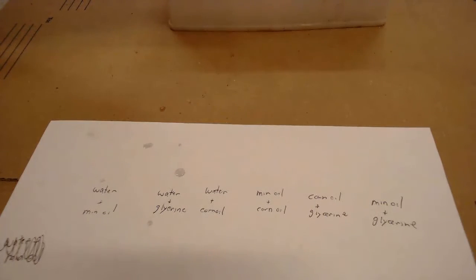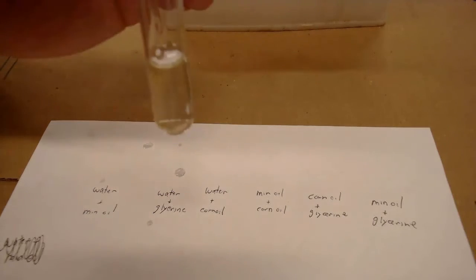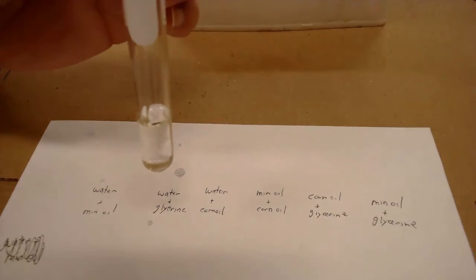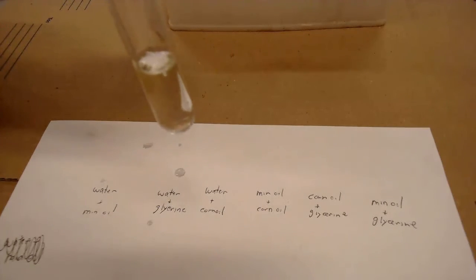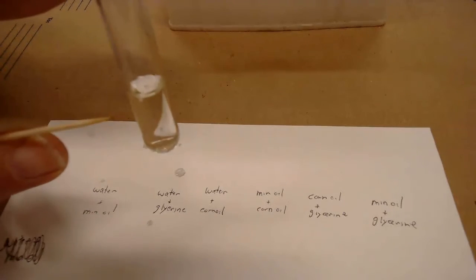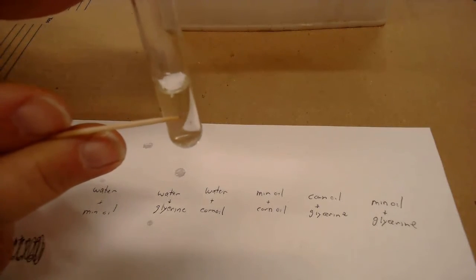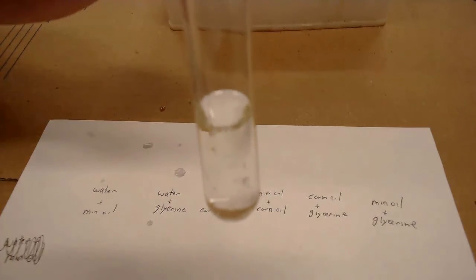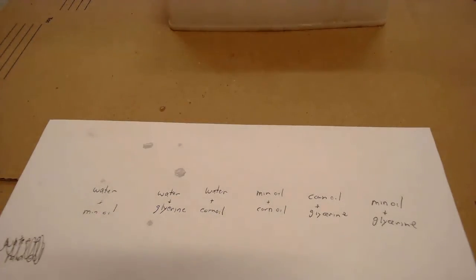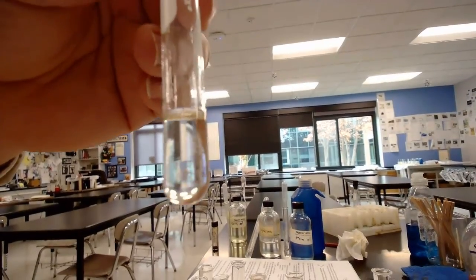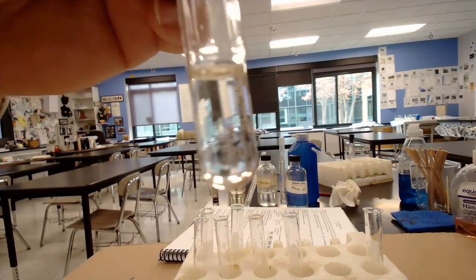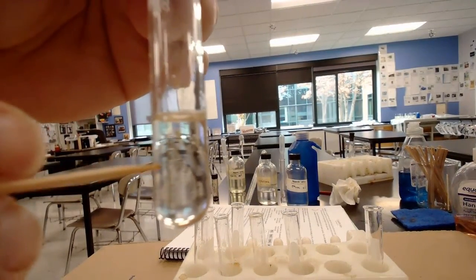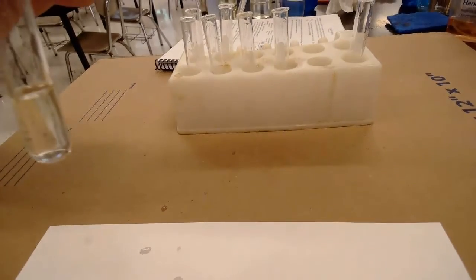Now the glycerin and the corn oil. This one's a little bit tricky to see. If you look at the colors, it's very hard to see that there's a separating line between the two liquids — especially on camera. But if you move it around a little bit, you can detect it right about in the center. Hold it up to the light — see that area right in there where it looks different? That's the separating line. So corn oil and glycerin are immiscible.